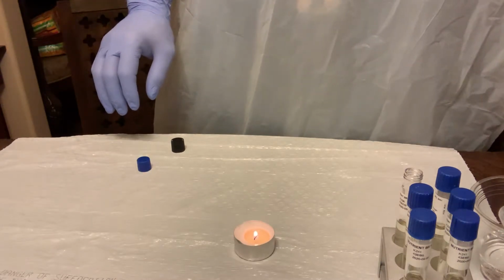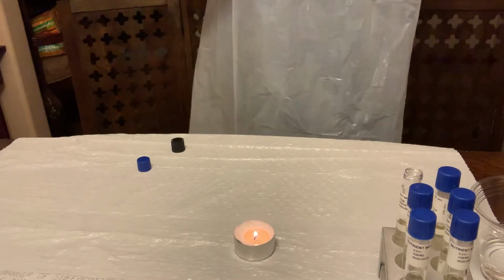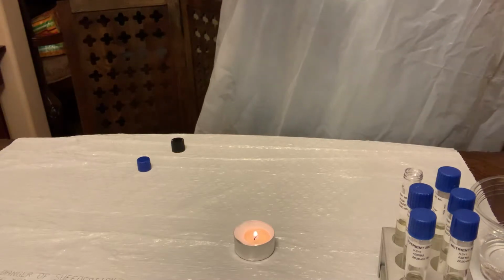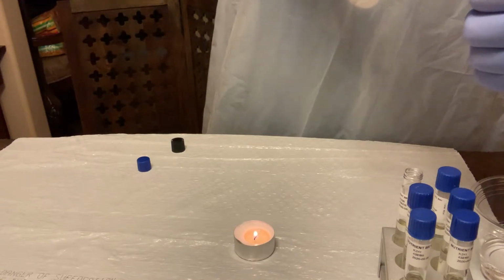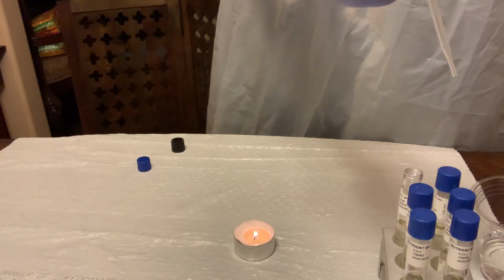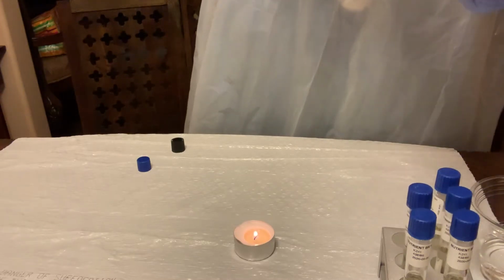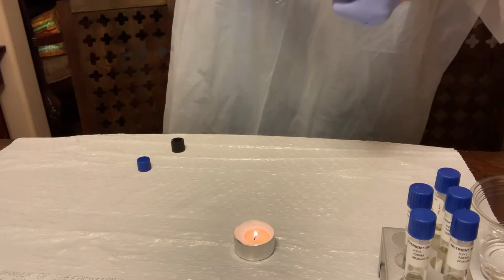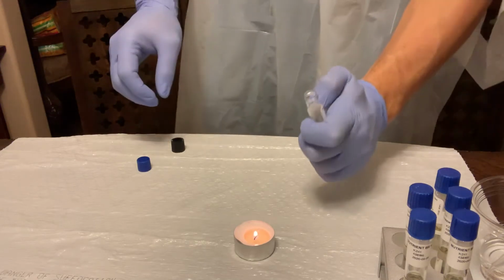Cool. All right, we've got our pipette, and we're going to be taking 2 drops and dropping that in there. So let's take 2 drops. All right, we've got 2 drops. And then let's take this and inoculate it here. 1, 2. Cool.